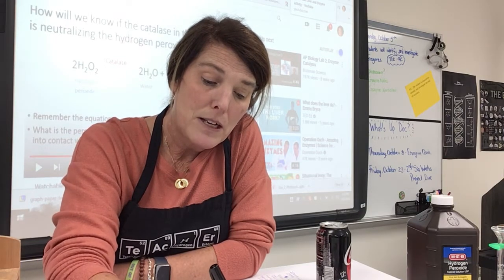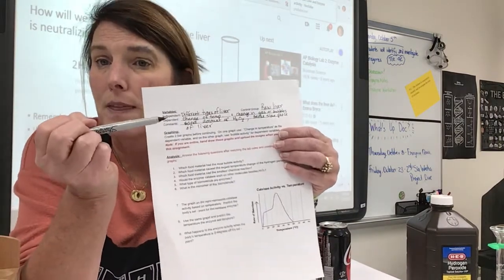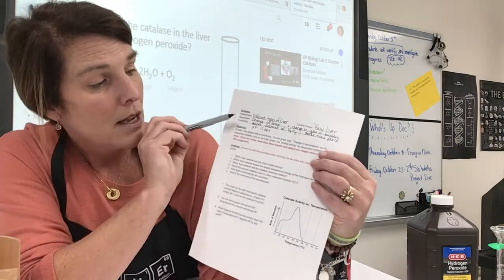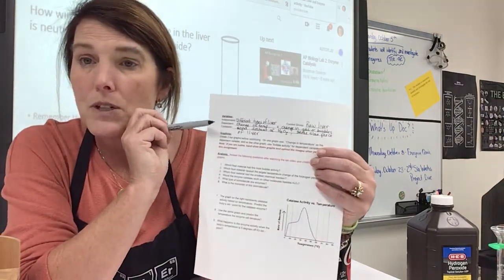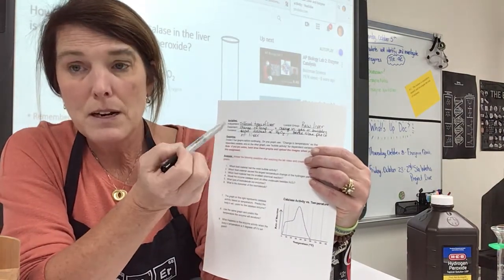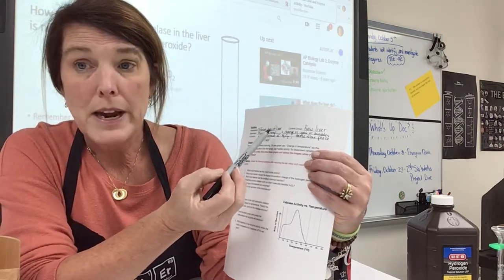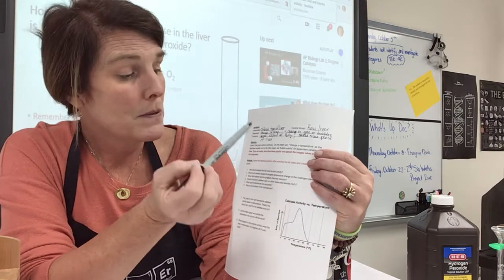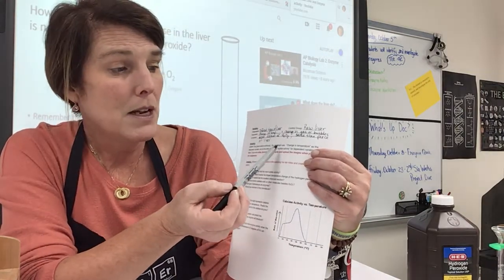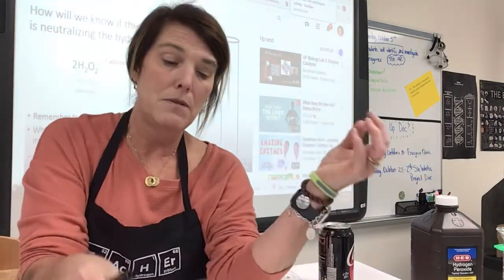That makes up a good experiment. We have our independent variable. One thing we're doing differently, we treated the liver differently, or your teacher did ahead of time. Your dependent variable will change depending on the different types of liver, and it will also be something that we measure. We're going to measure the temperature, and we're going to measure the amount of bubbles. Our constants are the things that we keep the same, whereas the same amount of hydrogen peroxide we will give each one, and we started with the same size sample of liver.